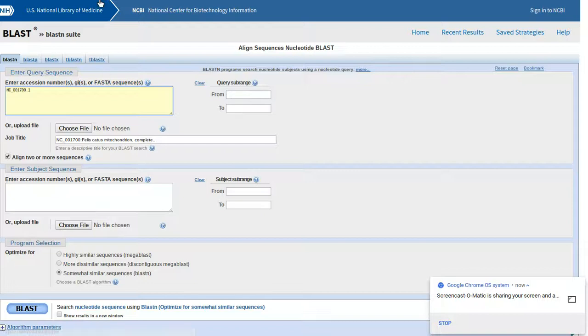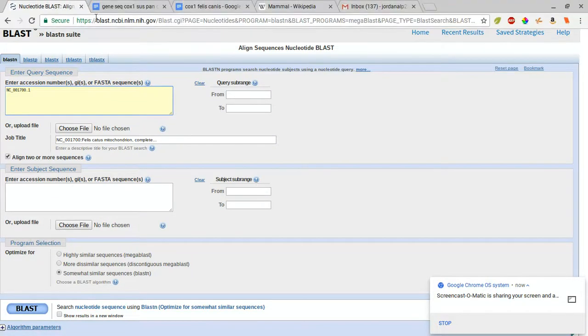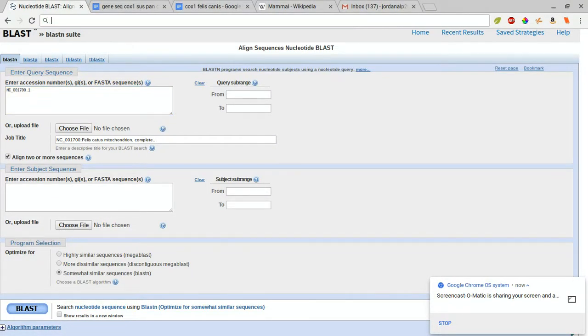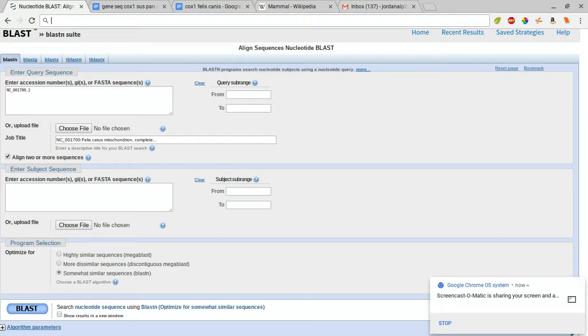Okay, hello. Today we're going to go over how to compare two nucleotide sequences of a gene from two different organisms to compare their similarity in genetics.